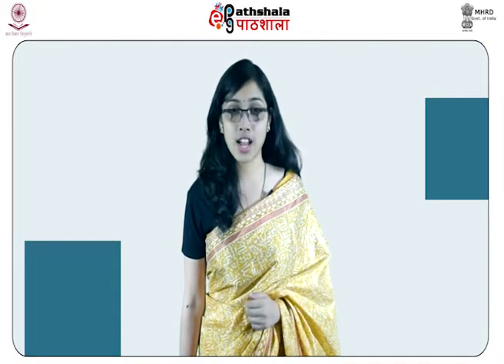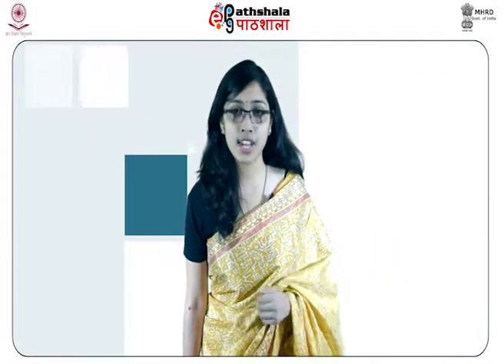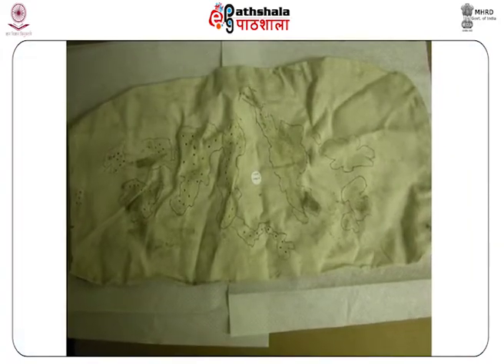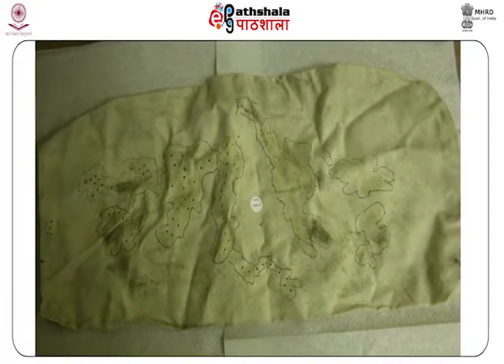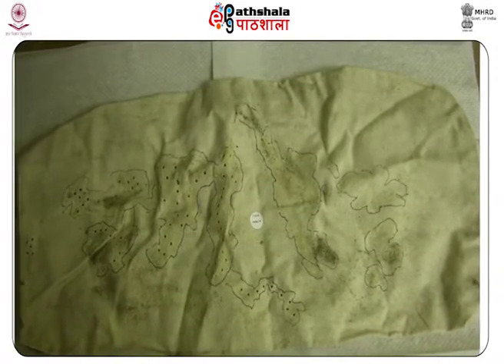Visual location of semen is a difficult task because the stains are almost colorless and can be destroyed by washing. Semen stains are found on the persons of the victim and the culprit, on their garments, at the scene of occurrence, and in a vehicle if one is used for the commission of the crime.